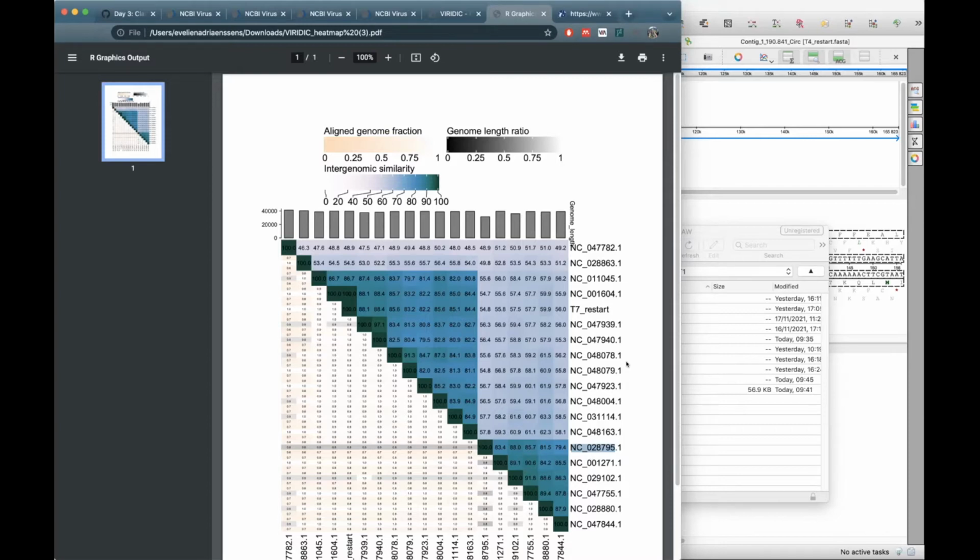If you have 100%, 99% together, then you can just say phage Melinda 1 belongs to the species Escherichia virus T7, in the genus Teseptimavirus, and leave it at that, and then in your paper talk about your phage rather than about the taxonomy.